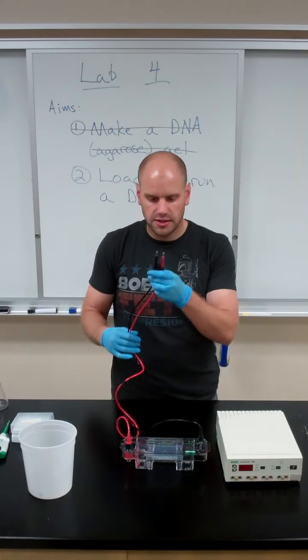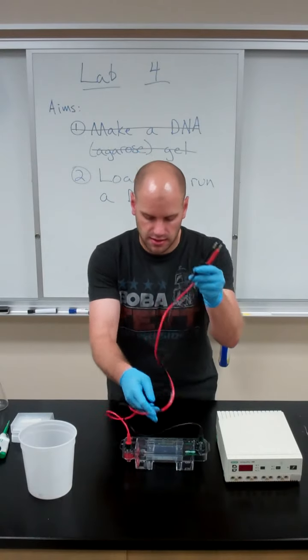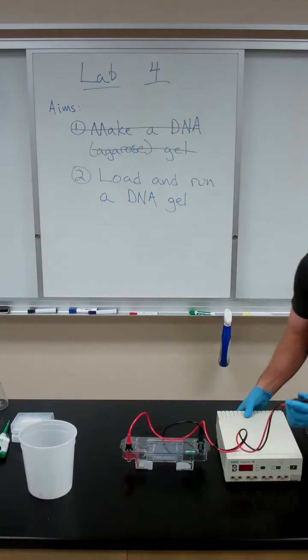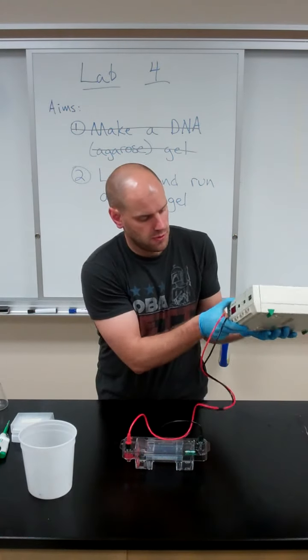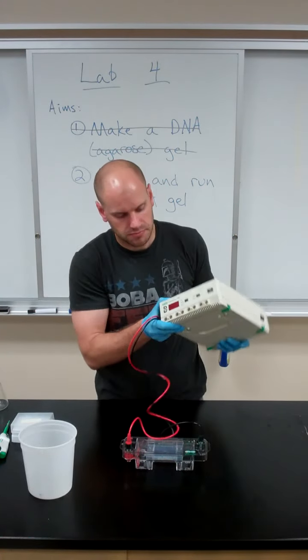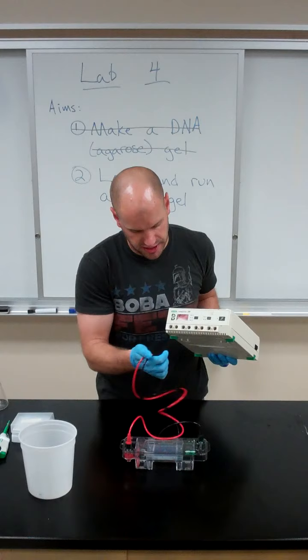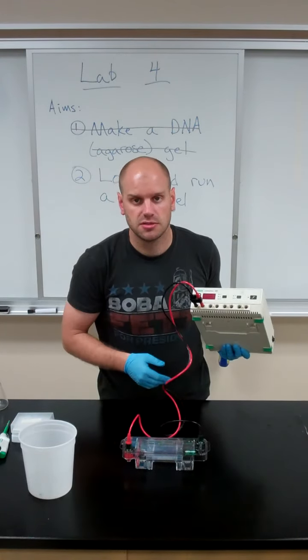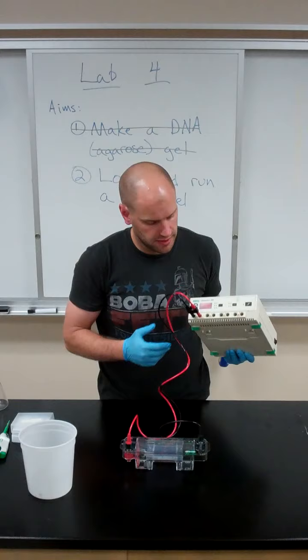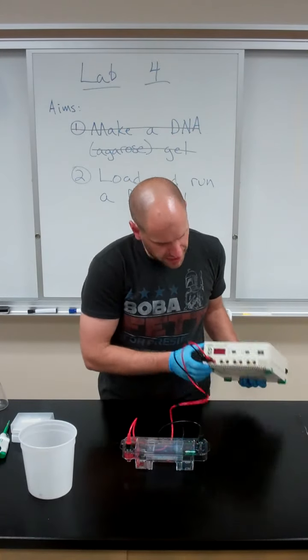And the same thing goes for when you're connecting the leads to the power supply. The power supply will have four pairs of inputs on it. Again, you're just going to want to keep the colors red to red, black to black.